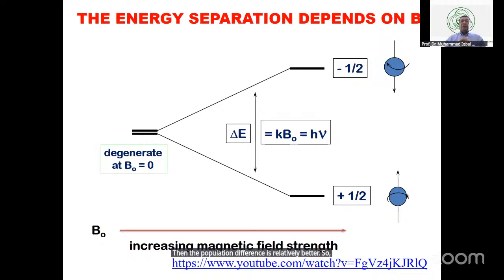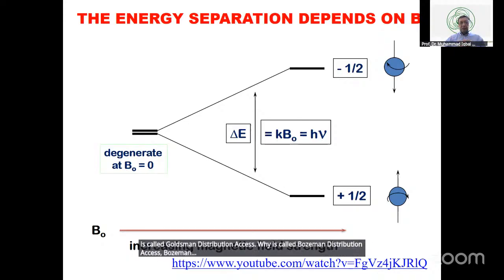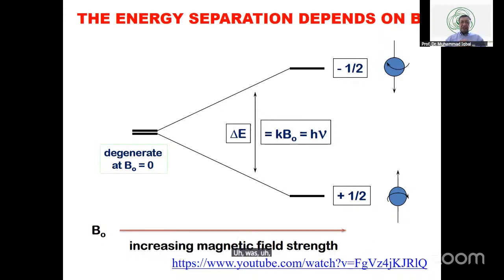The population difference between the low energy state and high energy state is called the Boltzmann distribution. Why is it called the Boltzmann distribution? Boltzmann was an Austrian scientist, Ludwig Boltzmann, and it was in the 19th century. It has nothing to do with NMR, but he was trying to explain.